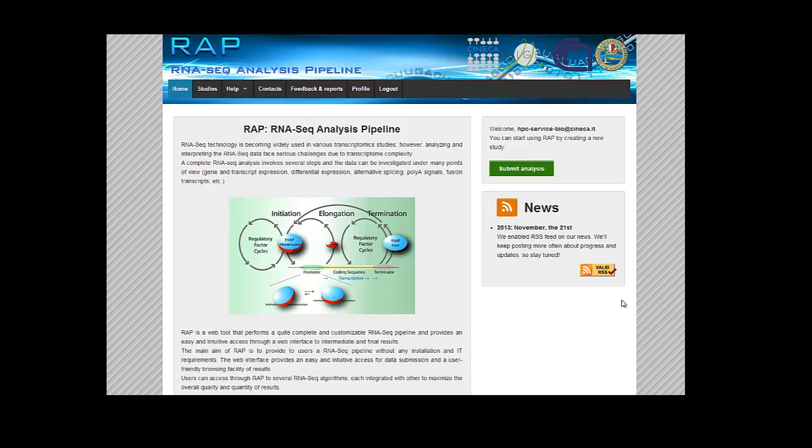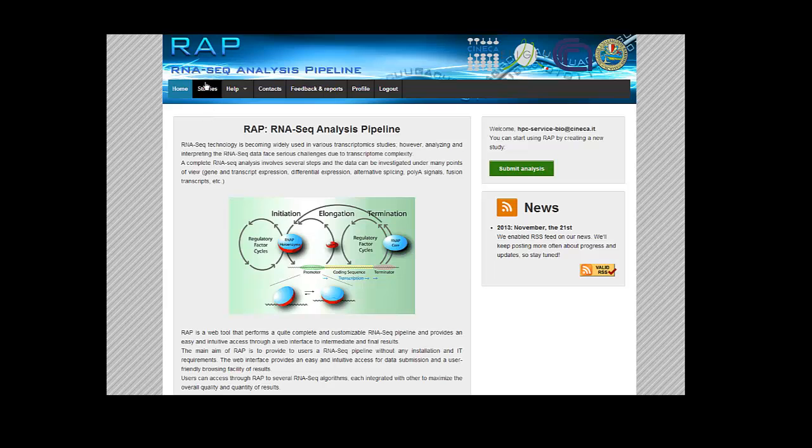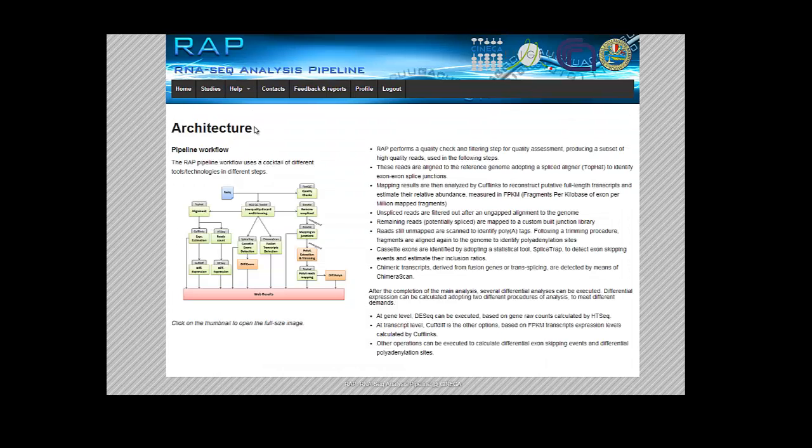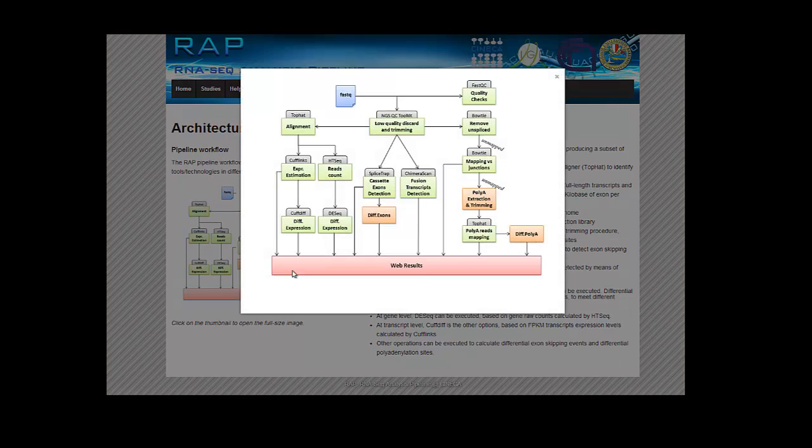Hi, welcome to our first RAP tutorial. In this tutorial, we're going to give you an overview of our RNA-seq pipeline web tool, RAP. Our web tool allows you to submit a full RNA-seq analysis from raw data, usually FASTQ files, to final results such as differential gene expression, fusion transcripts, differential polyA, and so on.